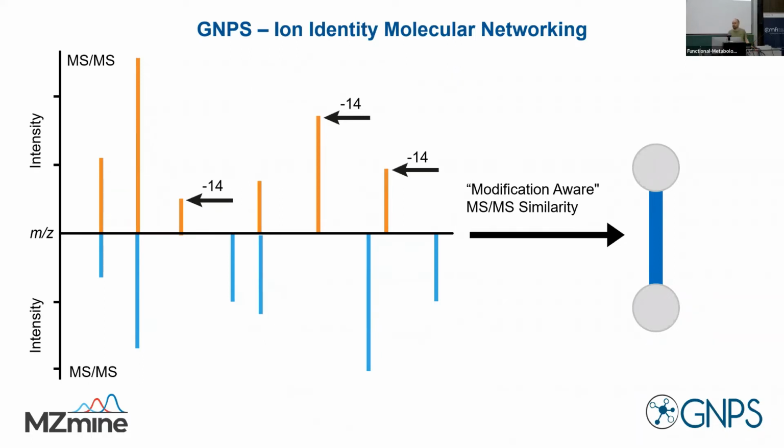Now if you have a very complex data set where one node is related to many molecules, then once it reaches 10, the lower scores will be cut off. Then there's also a maximum network size. That's very critical for very complex data, or especially if you have chemical classes that have many variants.